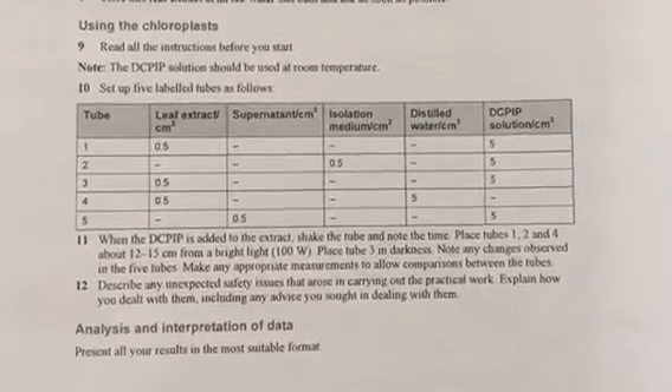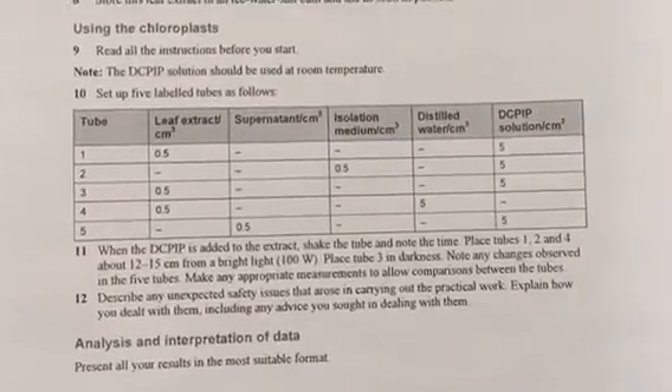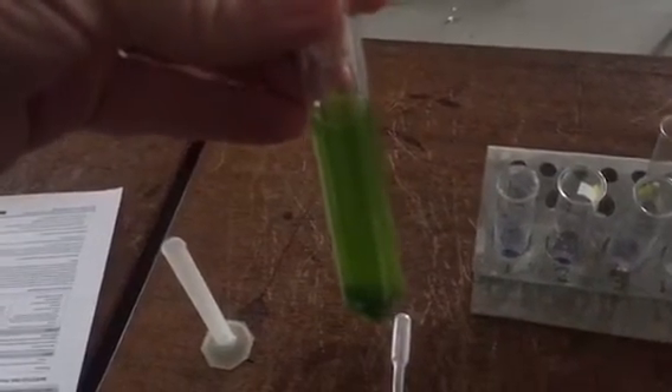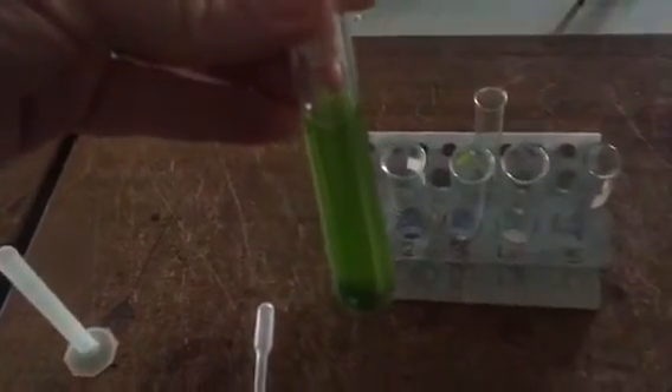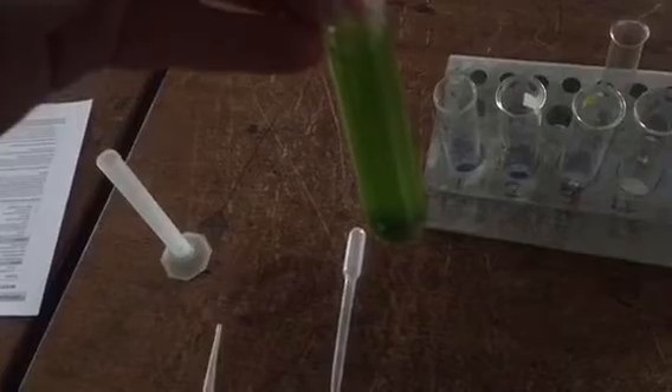While we are waiting for the centrifuge we have got to make up our five tubes - here is the table showing what is going to go into each one. The centrifuge is now finished and we have our extract of chloroplasts with a nice pellet at the bottom and the supernatant at the top, which is basically the cytoplasm of the cells. We are going to put 0.5 millilitres of the supernatant into tube five, then pour away the rest of the supernatant and resuspend the pellet in some isolation medium.